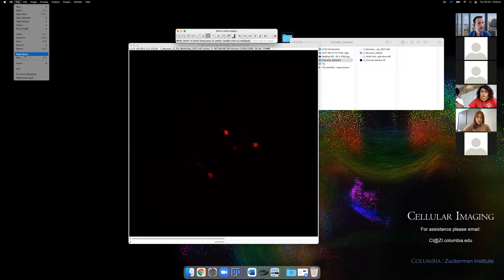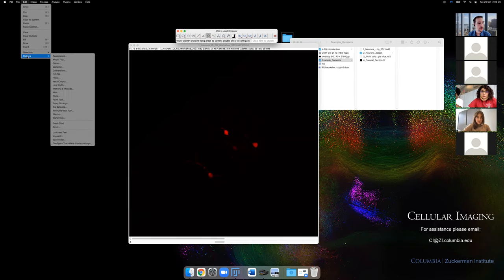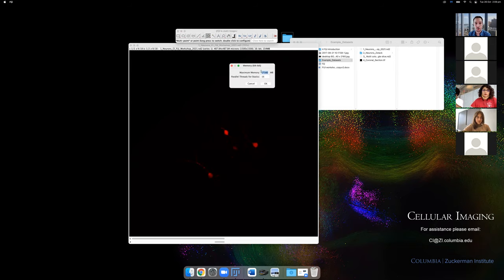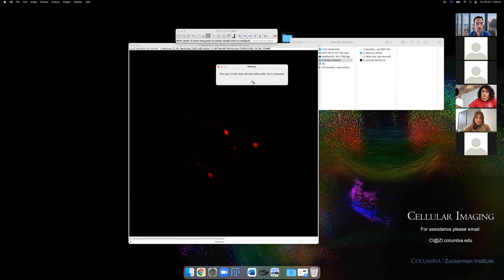This information is especially useful for light sheet data, where it can be difficult to get image dimensions otherwise. If you've just installed Fiji, there are some things to take care of under Options — in particular memory management. Make sure you've allocated the amount of memory your computer actually has, because it sometimes defaults to a very small amount, and you'll get stuck quickly when working with big stacks or slide scanner data.